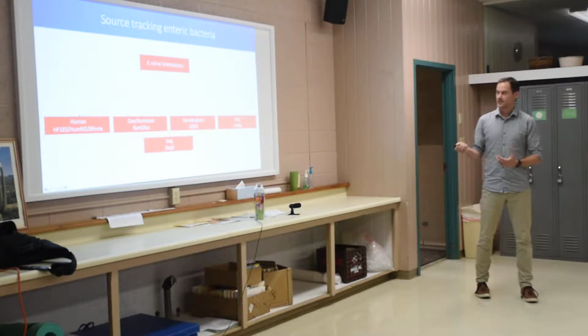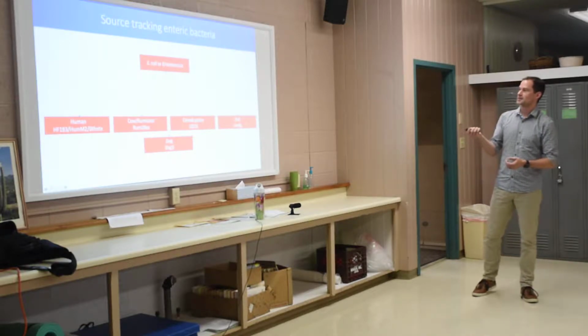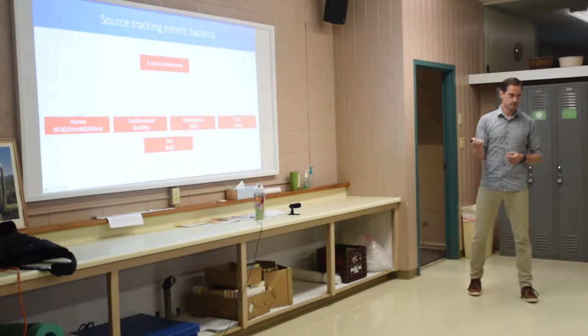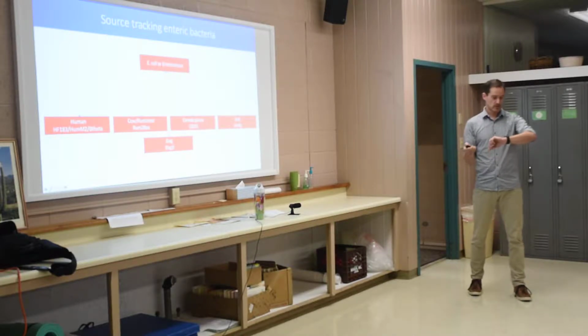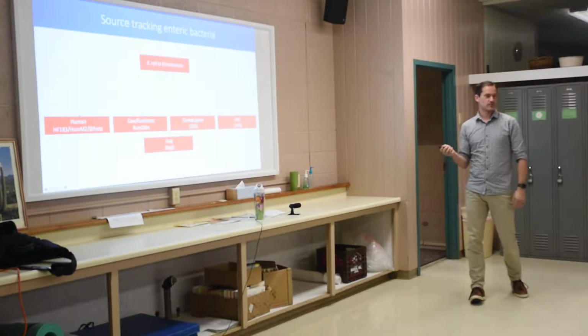Enteric bacteria, from a qPCR monitoring program perspective, you're typically monitoring for one of two different bacteria, either E. coli or Enterococcus. There's a long history for why you monitor for those, and I want to make sure that I try to keep close to on time. So we'll talk about that later when somebody asks a question about it.